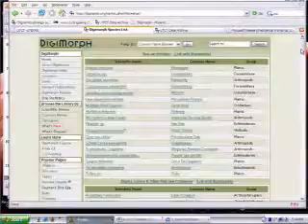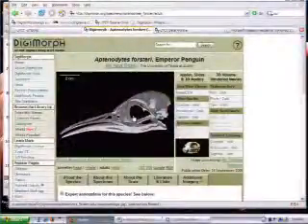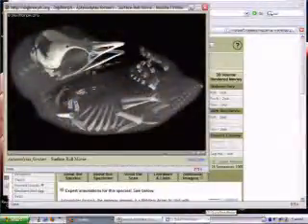The digital library that I'm associated with is the Digital Morph project. We have approximately 500 biological objects that we have scanned, everything from flowers to fossils, dinosaurs, fish, birds. Our most recent scan is a baby and an adult skull of an emperor penguin, the one from the most recent movie. These are specimens for which we have made animations. I have one loaded here.